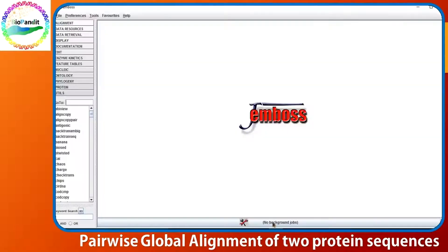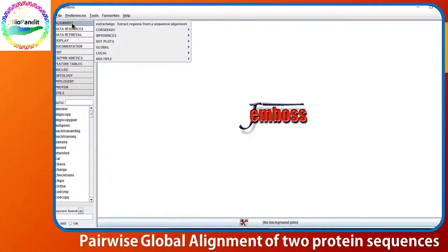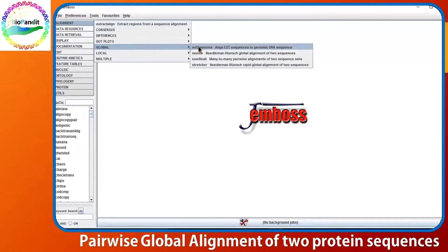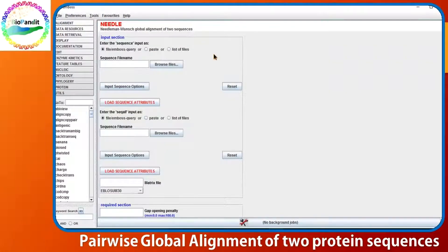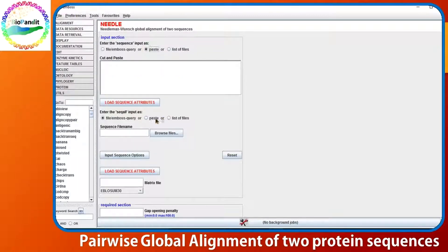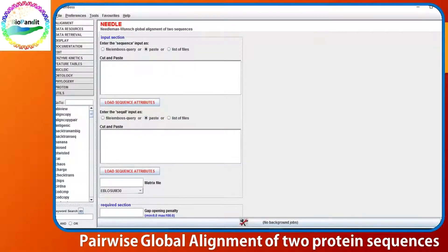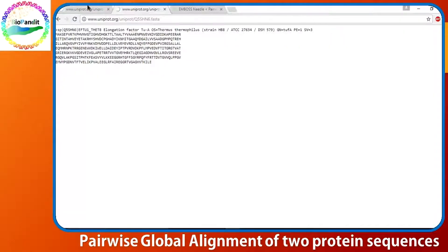We always prefer and recommend using the standalone programs. Giving the input in the EMBOSS standalone program is quite simple. You open the graphical user interface and find your program Needle. Two sequences are needed as input. You can either browse your sequence file or simply copy and paste your sequences.